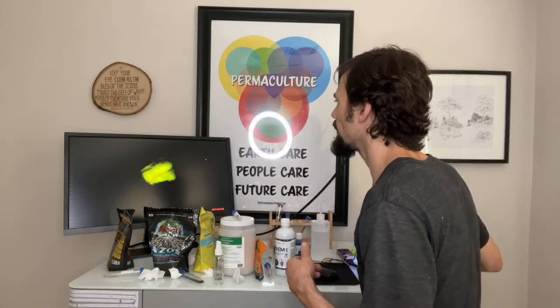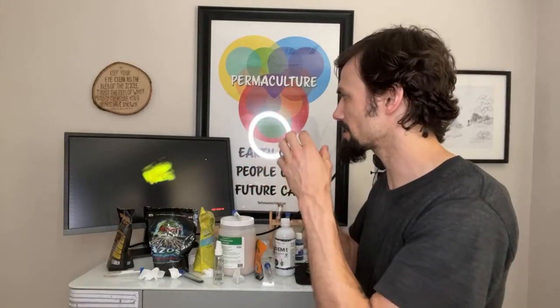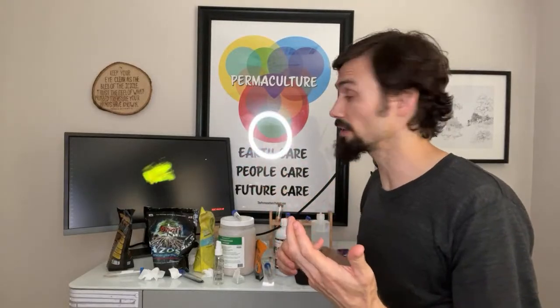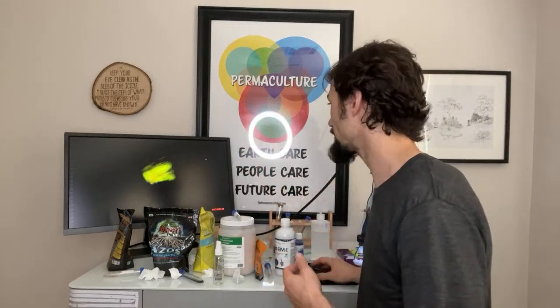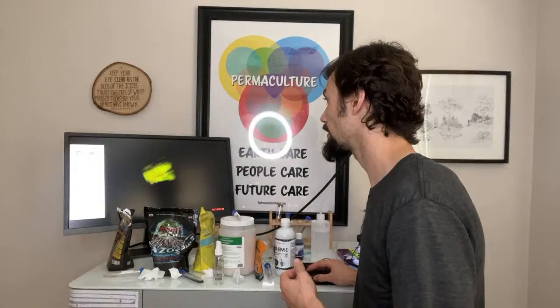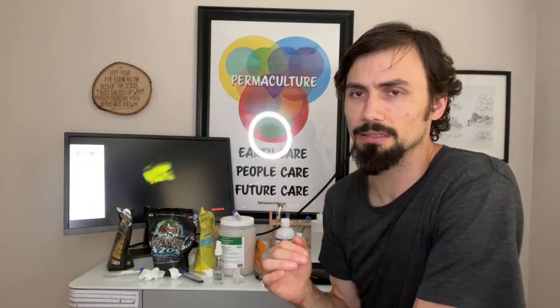The fungal hyphae wouldn't be stacked and compartmentalized like this in little subsections. That's plant matter, and it's glowing because it was inoculated by arbuscular mycorrhizal fungi. So instead of spores, they're all in with the pieces. And they don't have very many pieces, but those pieces do a great job. The argument is that they're superior to the spores because the spores decide to sporulate.